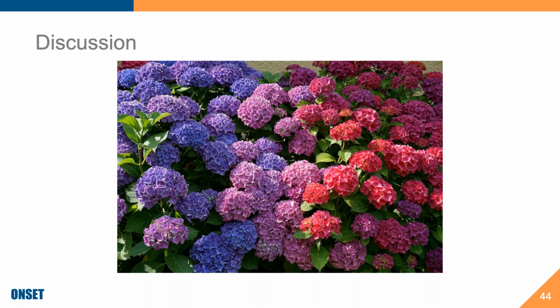Okay. Is there any additional recommendation for cleaning or reducing abiotic fouling? Aha, yeah, this is actually a really cool one. So thanks for asking that, Allison. In terms of the fouling, there are two different styles of fouling. One is the biological fouling, and one is the sediment fouling, essentially. So, for instance, with the pH logger that was deployed in acid mine drainage, yes, we were getting iron precipitation. We were getting a bunch of disgusting orange fouling on the electrode.